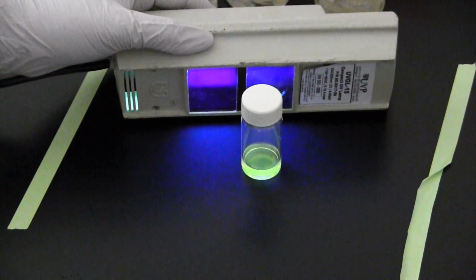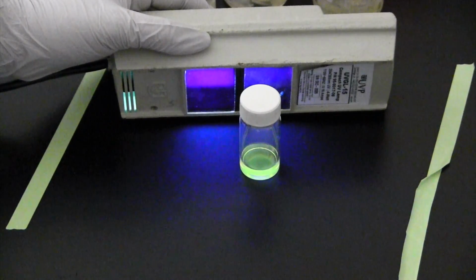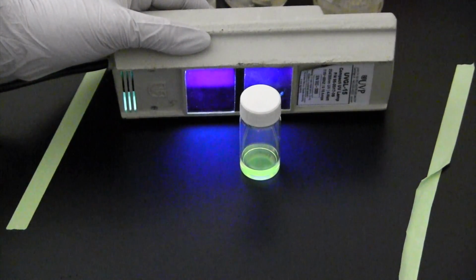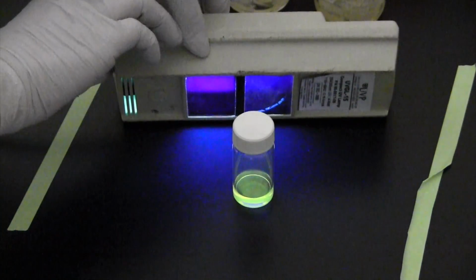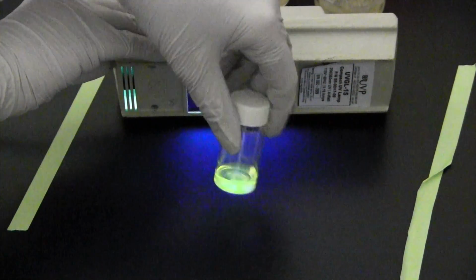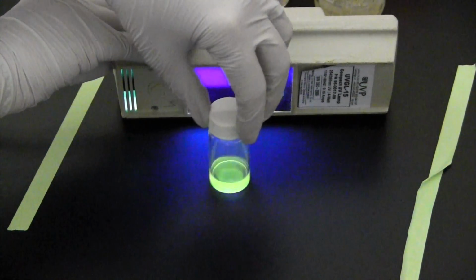So this is just one other addition to our chemical extraction, and a part of the course that students find really, really fun is that once you've taken that nice clean organic layer off the top of your extract, if you have access to a UV light or black light, it's really fun to shine this light on your samples and see all the rainbow of colors that you're going to see.